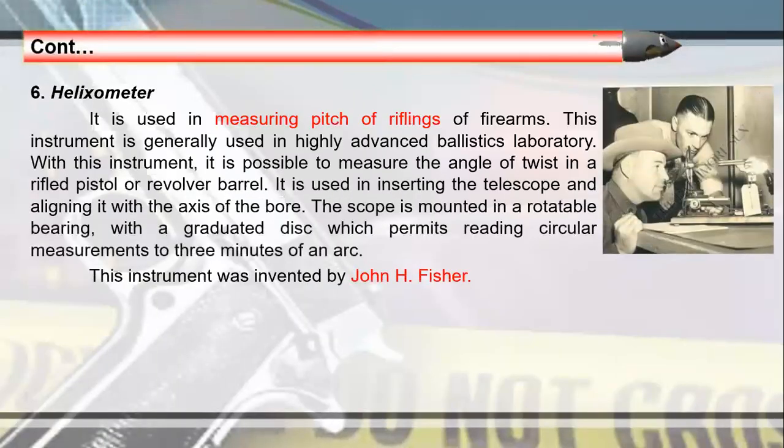Next, helixometer. Helixometer is used to measure the pitch of riflings or the inclination of the lands and grooves. Yung pagkaka-slant niya. Gaano yung degree or angle ng slant ng barrel.